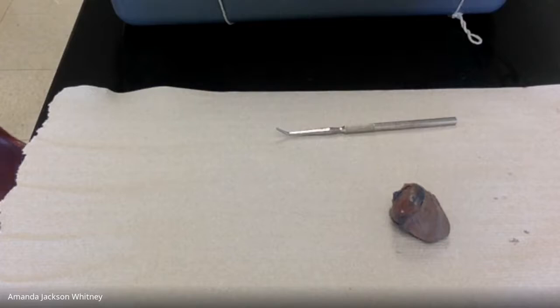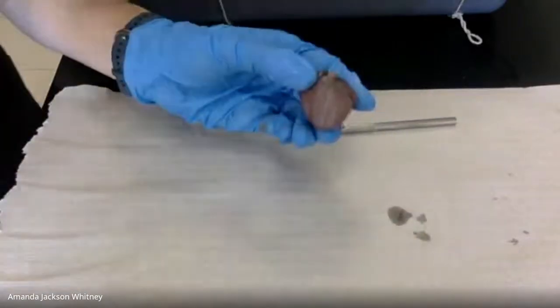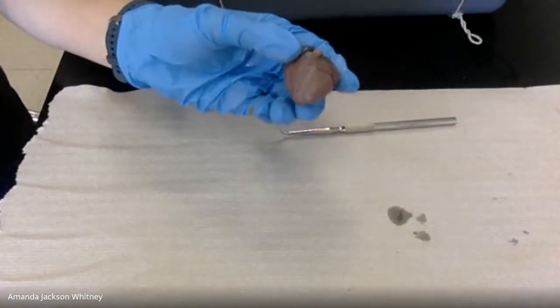You just use the razor blade, use some force. You gotta cut through the sternum, that's what that is. Okay. Alrighty, here we go. Heart.